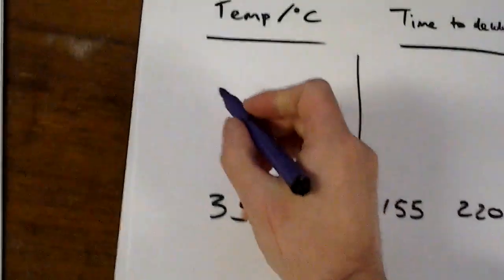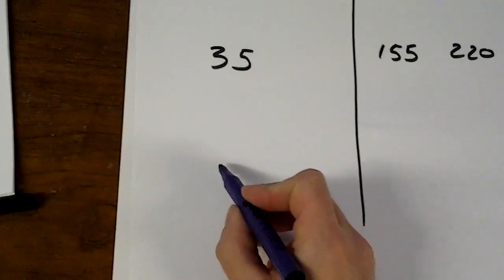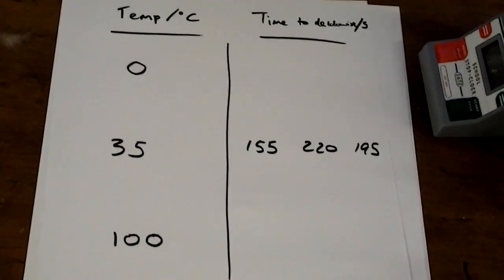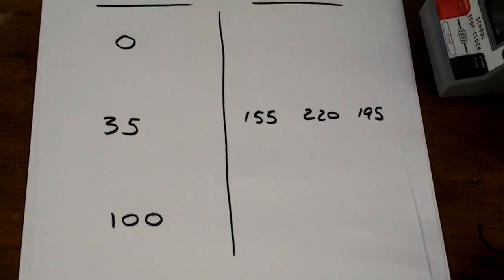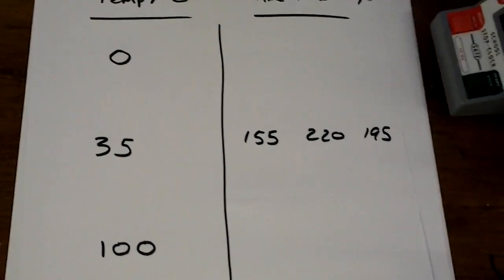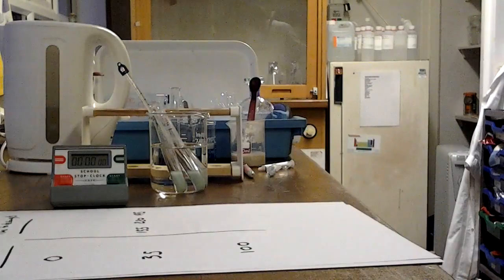Now, you need to think about this quite carefully, because obviously, theoretically in the lab, we could do everything between a temperature of 0 and, using a kettle, you might just about get up to 100 degrees centigrade. You need to consider which bit of that range you want to investigate, which is the sensible bit. You are looking at the action of those enzymes in respiration, so consider a sensible range, and also consider a sensible interval to go up in.